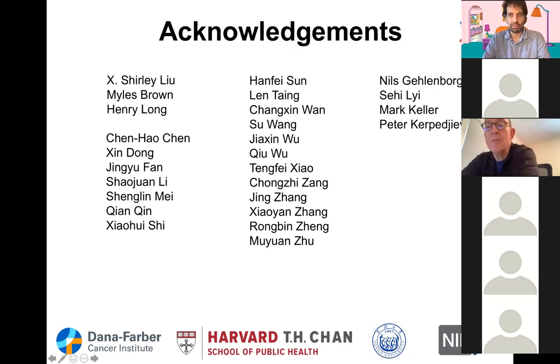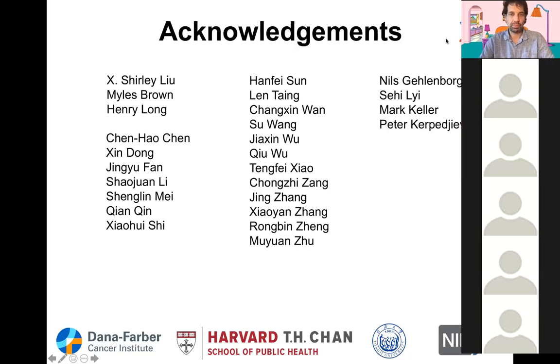But at the same time, we don't want this input gene list to be too big. You can imagine if you have 2,000 differentially expressed genes, when you input LISA, it will only give you more lineage-specific things, which may or may not have anything to do with the specific differential expression treatment conditions. And so the correct number of genes to input into LISA is important. We usually recommend between 200 to 500 genes to run LISA. Right.